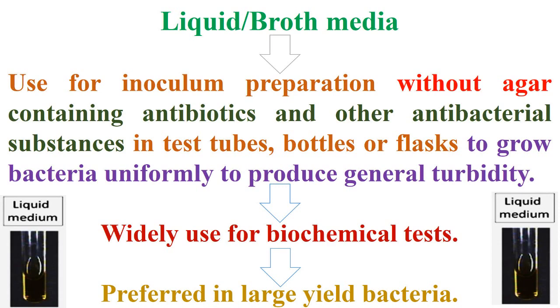Today, we are talking about identification of liquid or broth media that is used for inoculum preparation, without agar, containing antibiotics and other antibacterial substances in test tubes, bottles, or flasks, to grow bacteria uniformly, to produce general turbidity. Liquid media are widely used for biochemical tests, and preferred for large-yield bacteria.